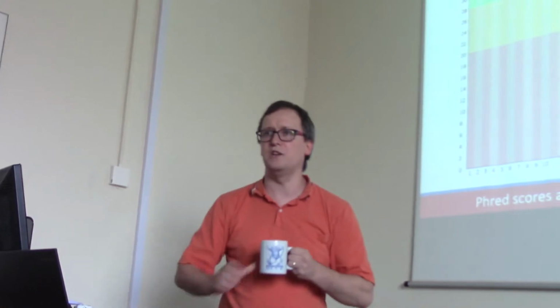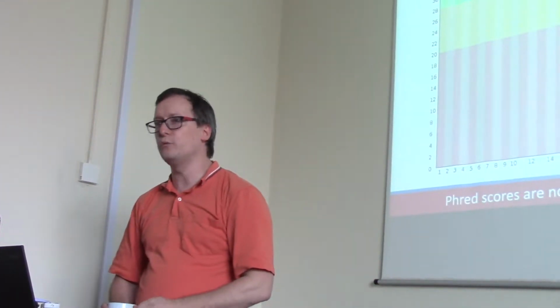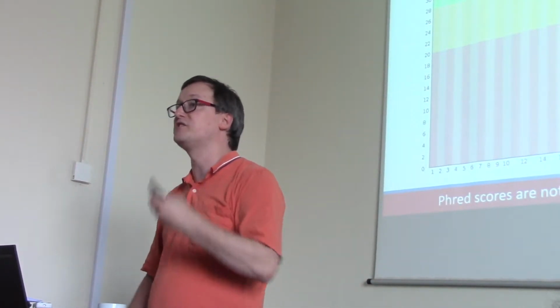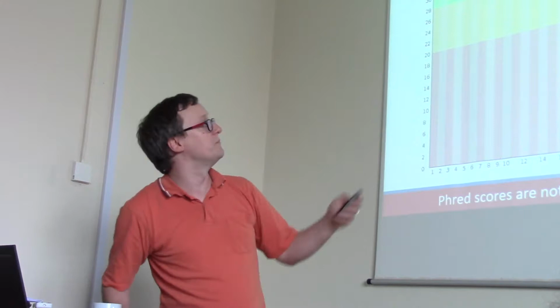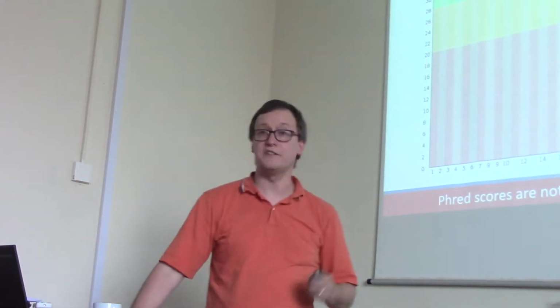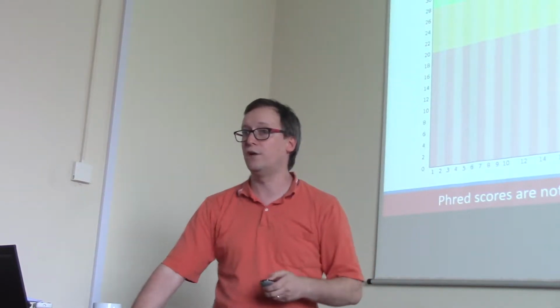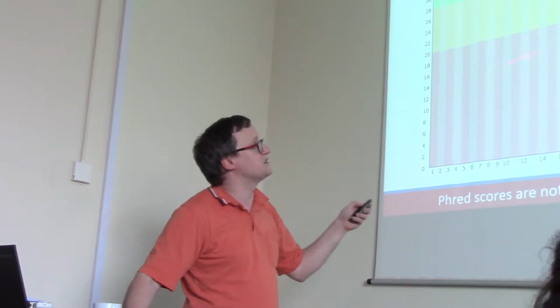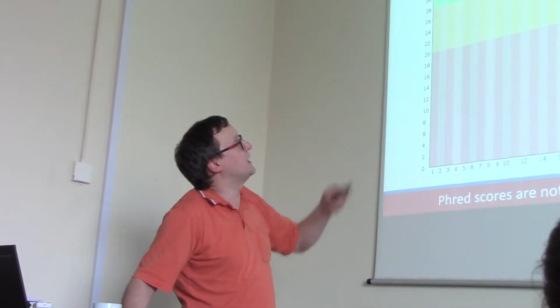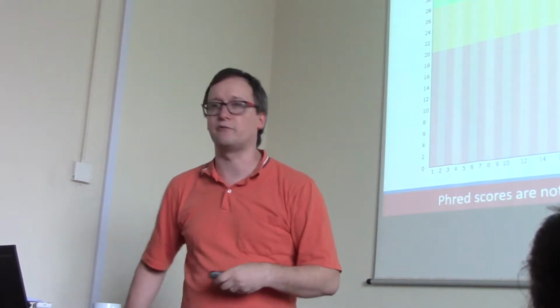Now, we mentioned FASTQC this morning, but now that we know what we know about Q values, the Phred scores for individual base calls, I want you to think again about this graph that we saw. Now, this is a different graph than we saw this morning. I was working from some data I worked with from Chia. This is another, just a sample diagram provided by the folks at Babraham, I'm not sure, who created this software to begin with.